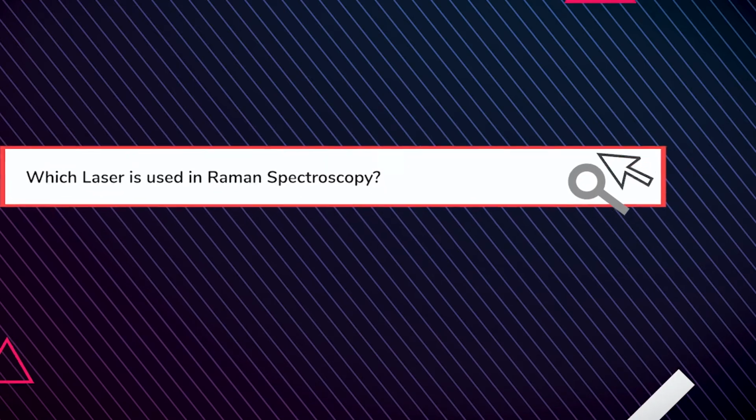Yeah. Which laser is used in Raman spectroscopy? Okay, so there's not necessarily just one laser that can be used. There are multiple lasers that are used, depending on what type of sample you're analysing, to optimise it. Same thing for something like portable XRF, you optimise your beam depending on what elements you want to analyse. In Raman, you can choose your laser energy based on what type of sample you want to analyse.